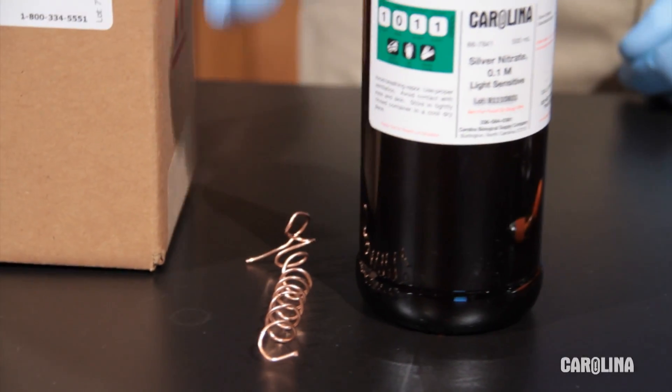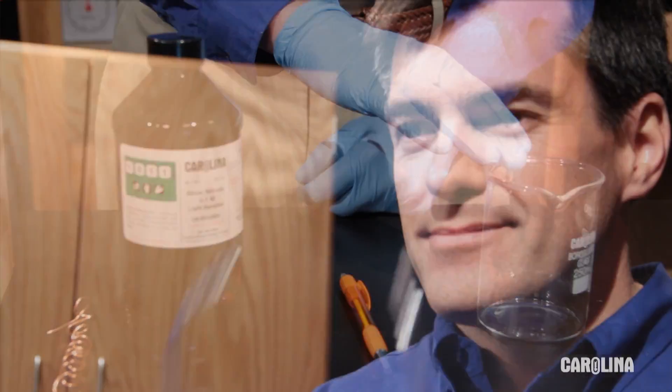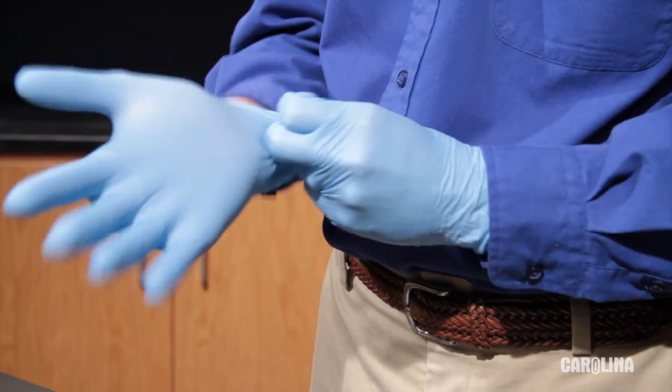The kit includes copper wire and silver nitrate solution. You'll also need a pen and a beaker. Be sure to wear safety eyewear and gloves when you perform this demonstration. Silver ions will stain skin.